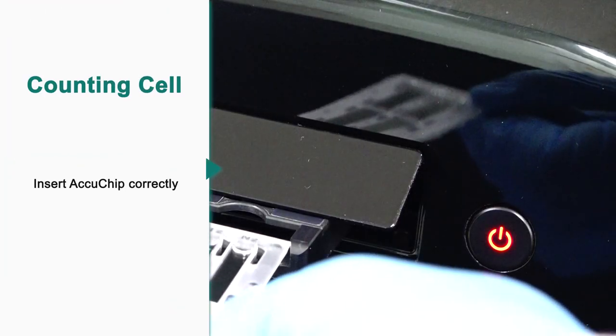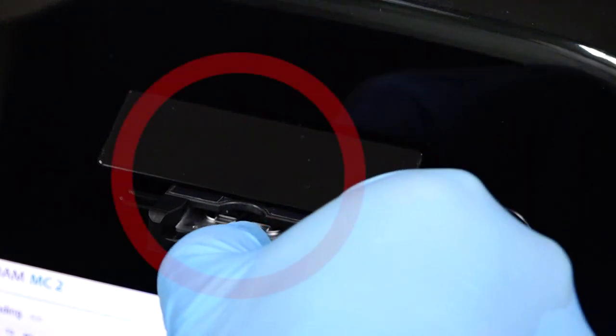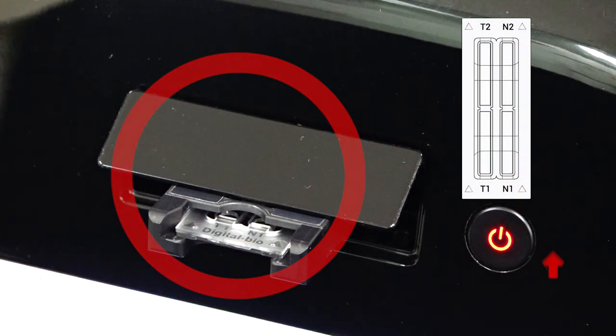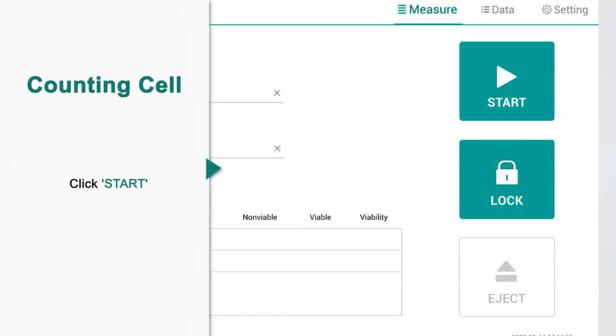Fourth, cell counting. Insert the slide into Adam MC2 correctly, then click the start button on the measure tab of Adam MC2.